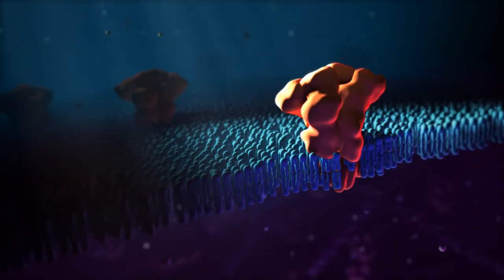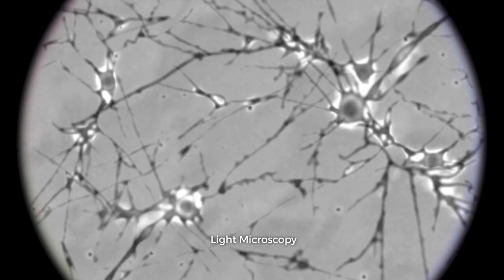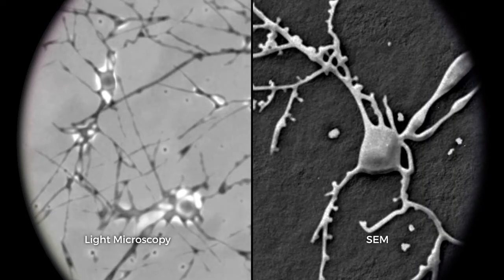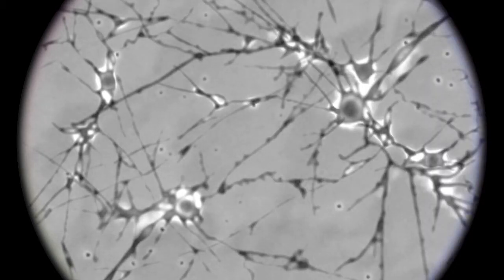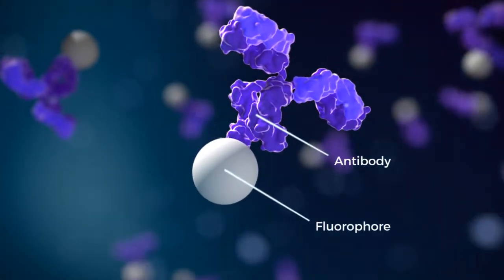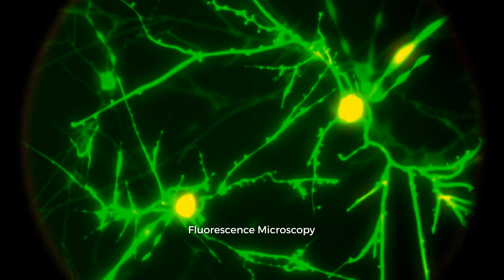The current imaging approaches available for observing live cells are limited to optical methods, since other ultra-high resolution methods, such as scanning electron microscopy, cannot be used to study living cells. To see molecules in optical microscopy, fluorescent tags known as fluorophores are used as molecular labels. These fluorophores are excited by light to create a fluorescent image.